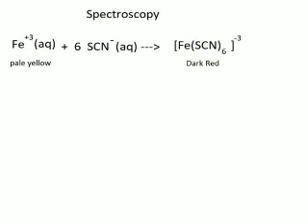The way we're going to get around this is we're going to add a solution of ammonium thiocyanate to the solution. In aqueous solution, the iron will latch on to 6 of the anions of the thiocyanate and form a metal complex, the iron hexathiocyanate. The nice thing about this compound is it is intensely dark red in color, as opposed to the very pale yellow that the iron plus 3 is all by itself.